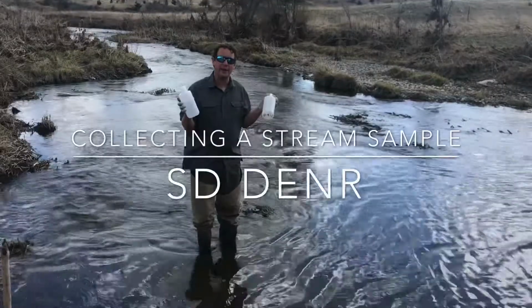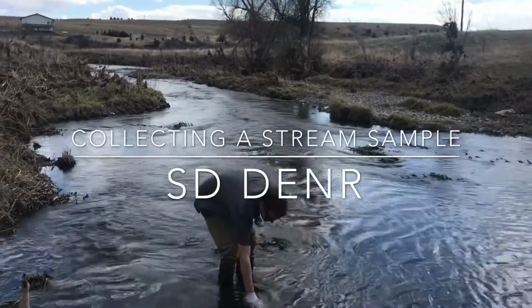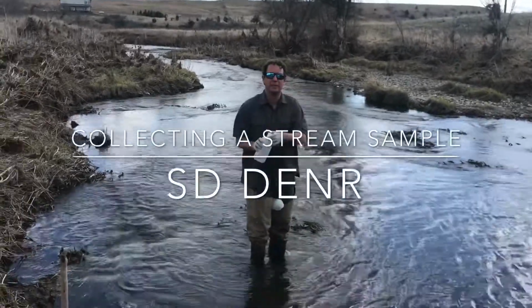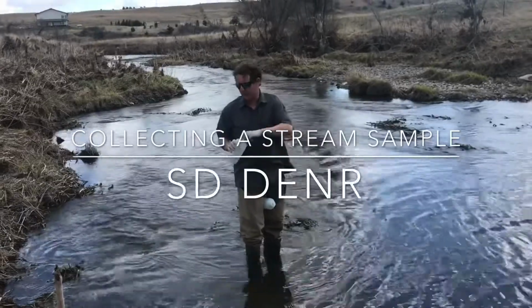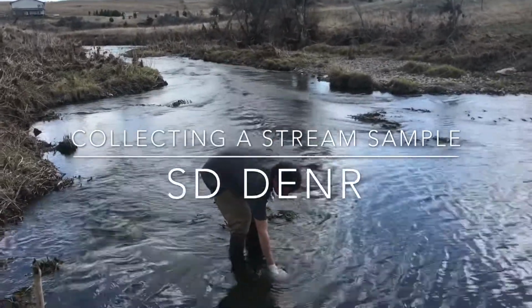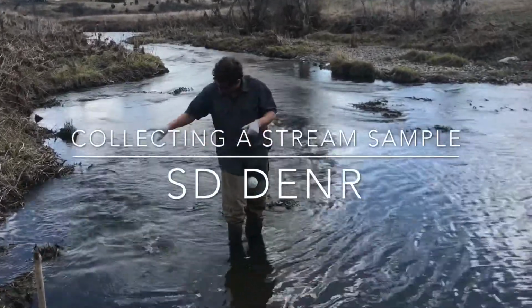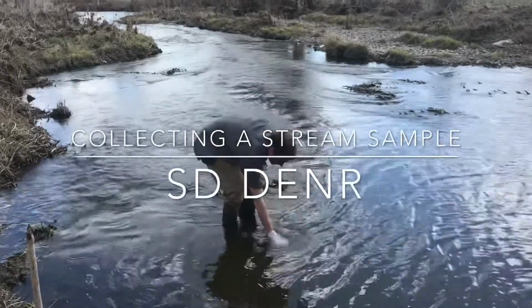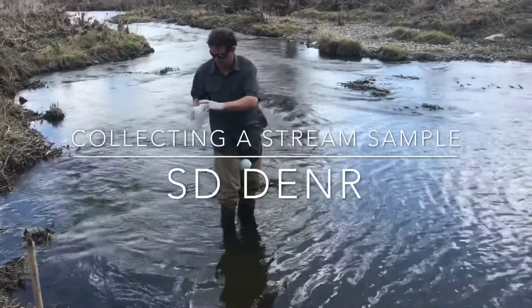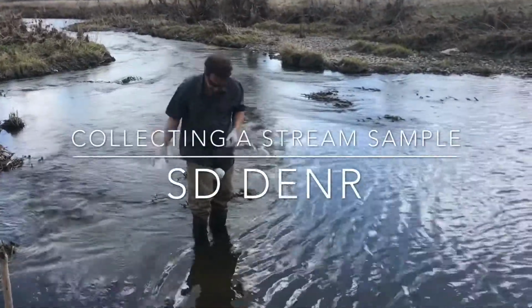Now we're going to do our A and B bottles, our 1-liter Nalgenes. These ones get rinsed. So we face into the current where our boots won't muck any of the sediment up, and get it into our bottle, and we start rinsing. 1, 2, and 3. Now we fill it up.